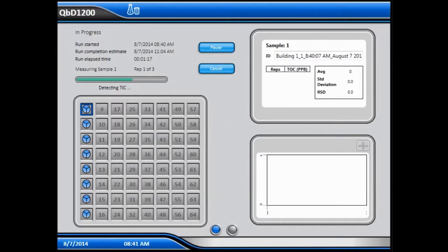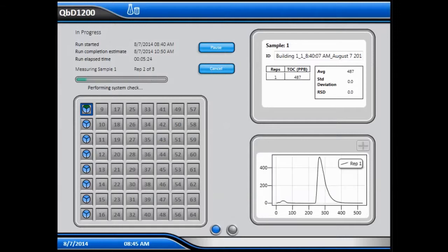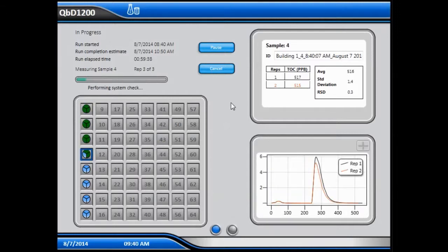We're in fast forward mode. You can notice that if you look at the time elapsed. We'll go up to the very first replicate measurement of this first sample. You'll see that then the shape on the first sample turns green.